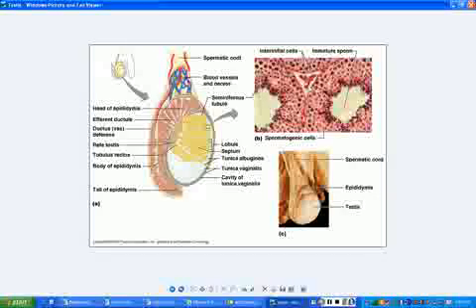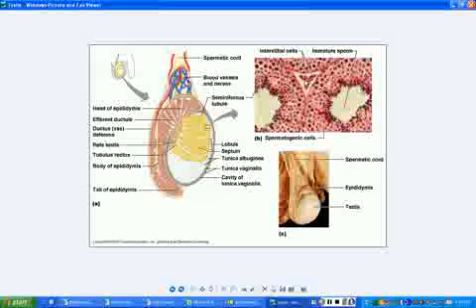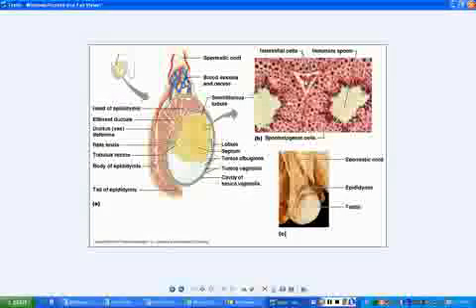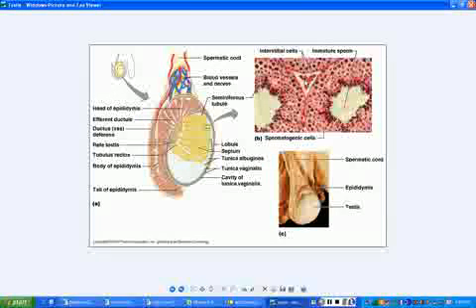Name these cells. And what do the interstitial cells do? Which? Testosterone. There you go. Please don't say it like that when you're in nursing.